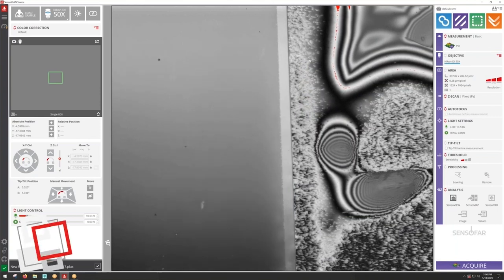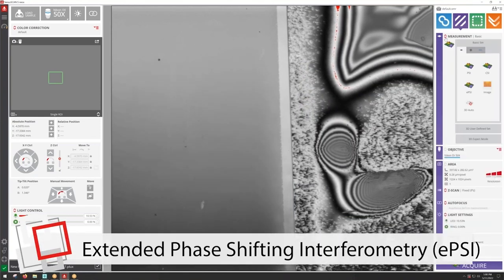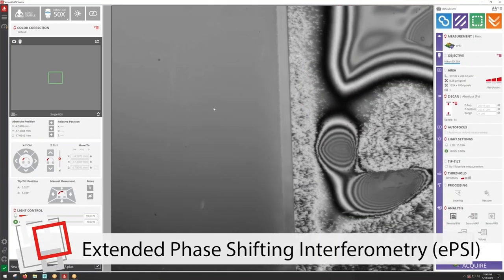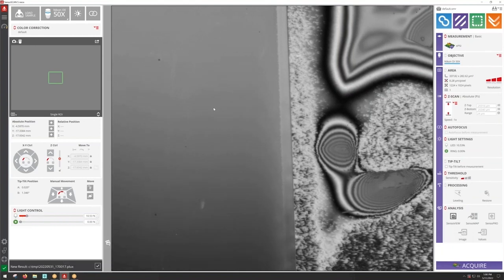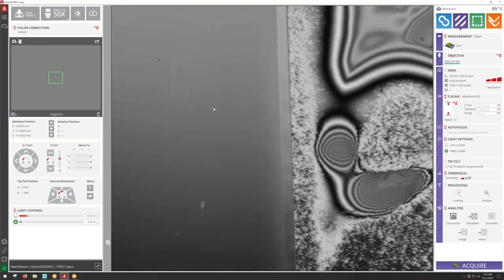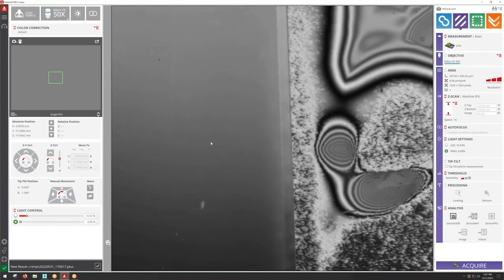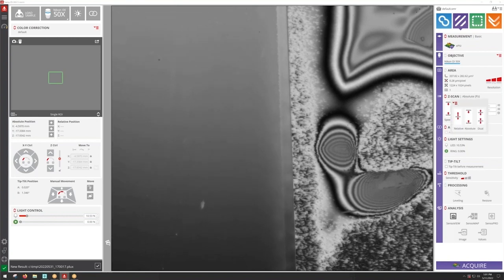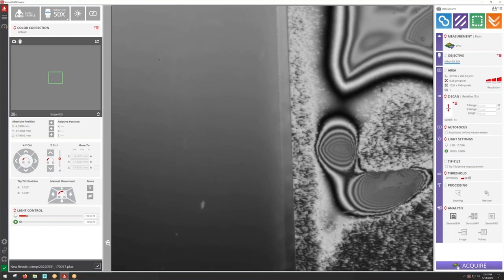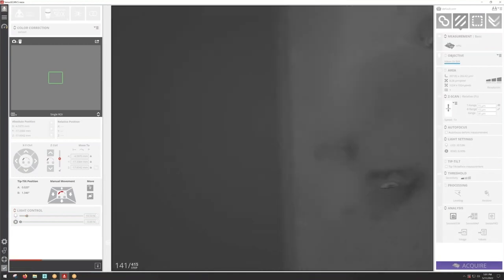All right so let's move on and go to EPSI. We're going to select this mode of interferometry and EPSI has to be understood as a technology that's a CSI optimized for smooth surfaces. So in here in the screen we can see a sample that has a very smooth surface on the left and a not so smooth surface which is a step height on the right. So let's go and acquire with this EPSI technology.